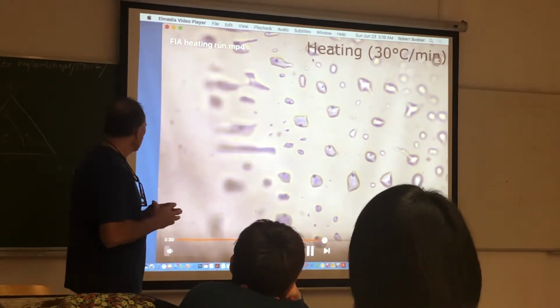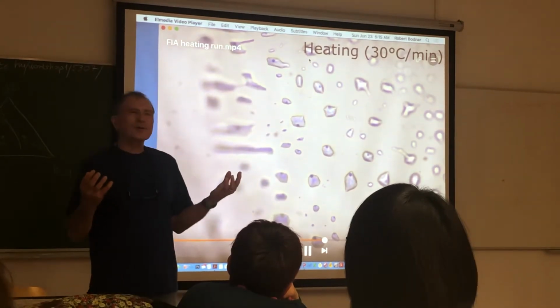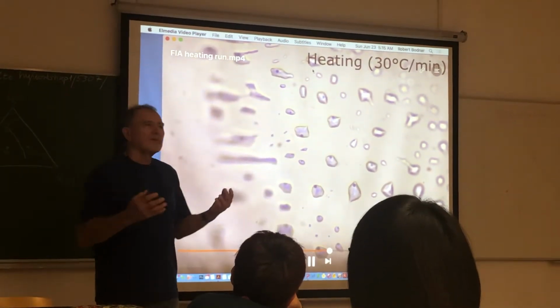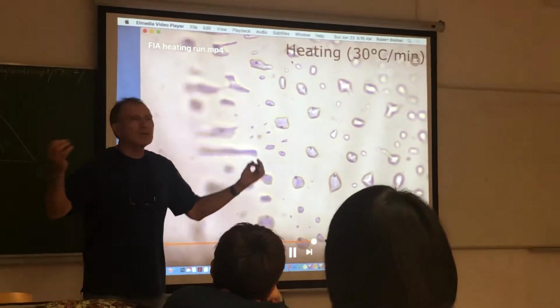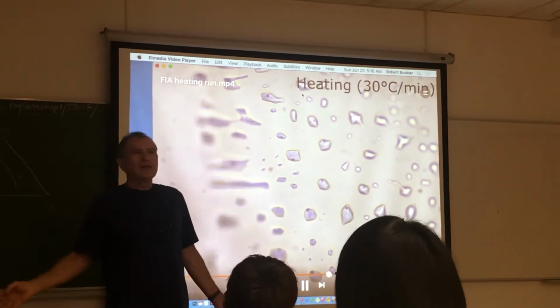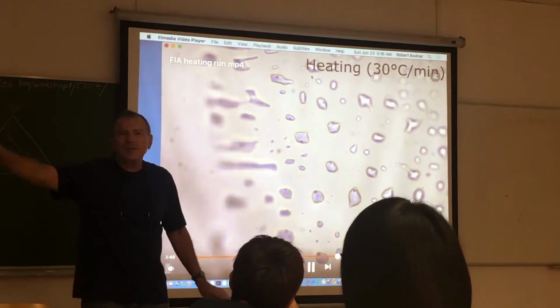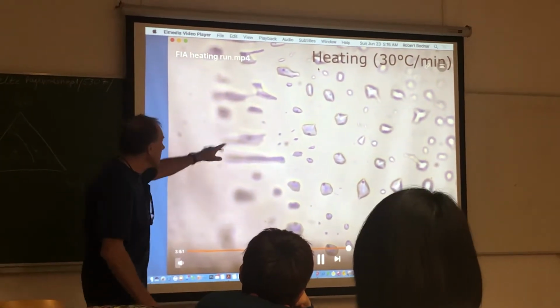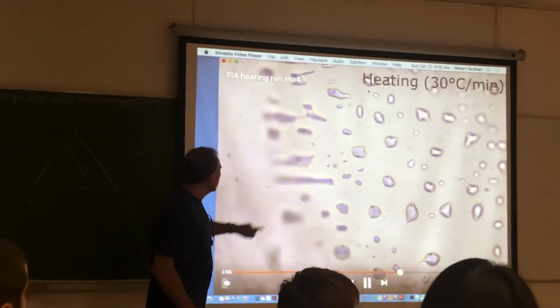Now, when you're doing this, and I say heat it up until all the inclusions homogenize, not uncommonly there'll be 1 or 2 outliers that for some reason have big bubbles, and you can see that those are very different from the other 99% of the inclusions in there. You would just ignore those few outliers. In this case, there aren't any outliers, I don't think. But anyway, now we're at 4 minutes, so we're getting really close.